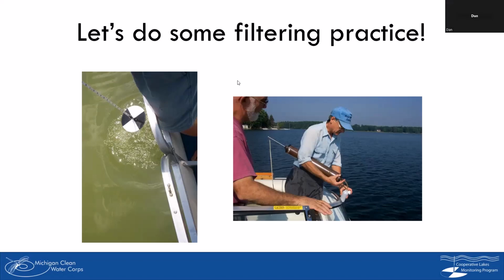I have a question. Go ahead, Dan. Yes. What would be the longest that you would want to hold a sample between collection and the actual filtering? In case I'm going to be out of town on sampling day, but not really trusting the collector to do the filtering. I don't know.